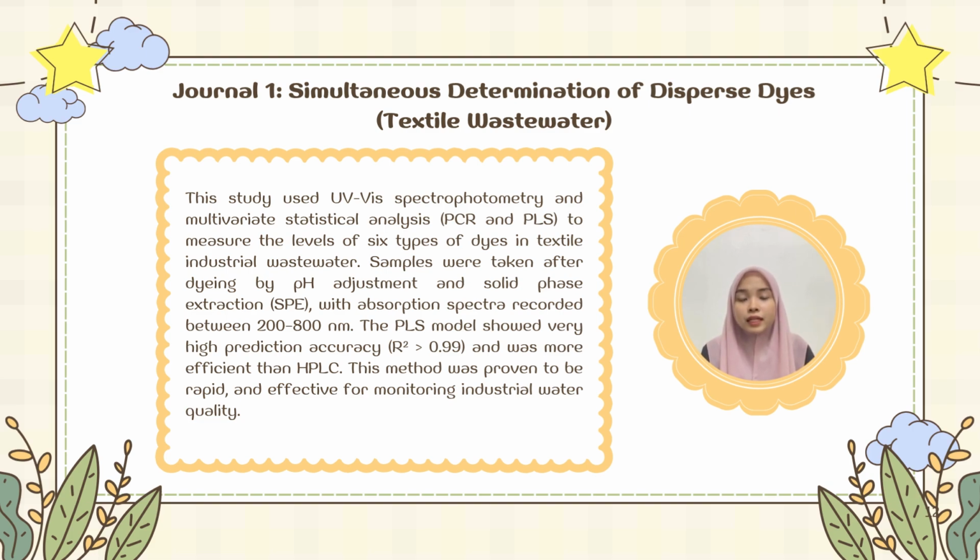The PLS model showed very high prediction accuracy, R² more than 0.99, and was more efficient than HPLC.